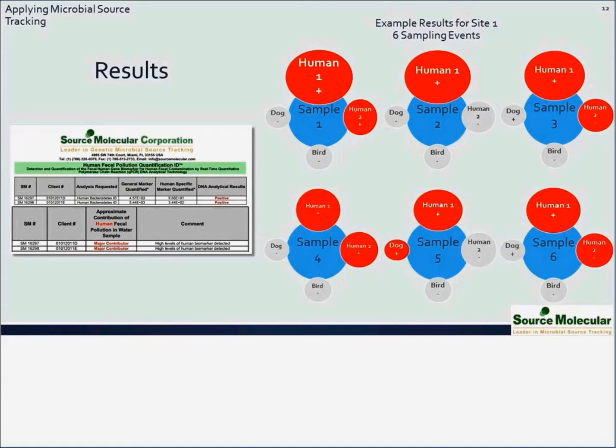And so this is really the way to interpret data from microbial source tracking analytical results. It's not going to tell you proportionally how much pollution is coming from each of bird, human, and dog, because they're targeting independent fecal indicators that don't necessarily relate to one another.